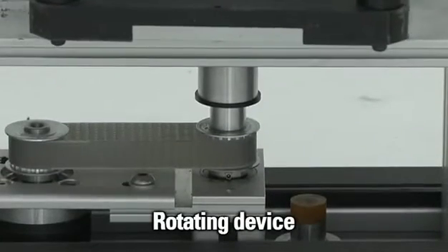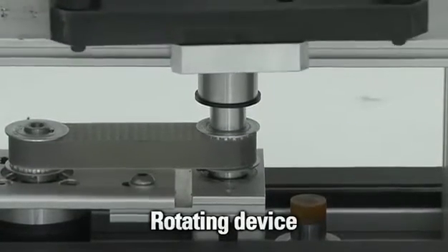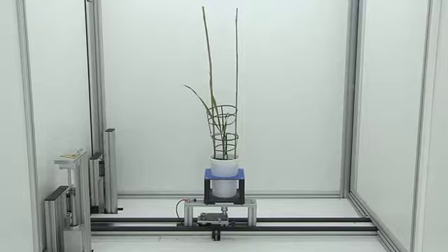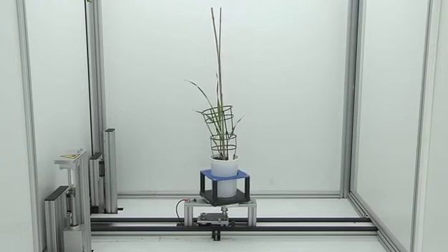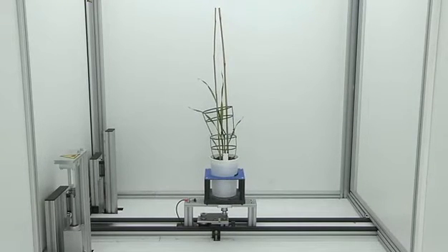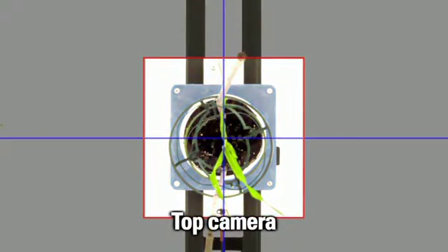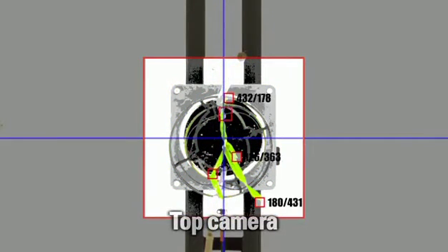Turning the plant provides multiple imaging from different sides for 3D vectorization. Additional top cameras complete comprehensive 3D information.